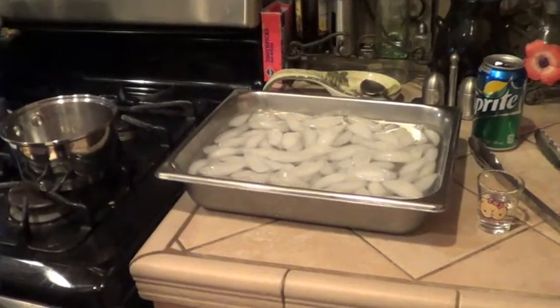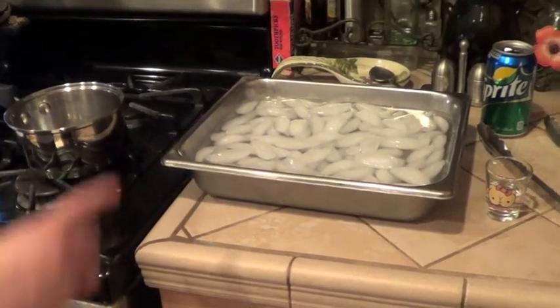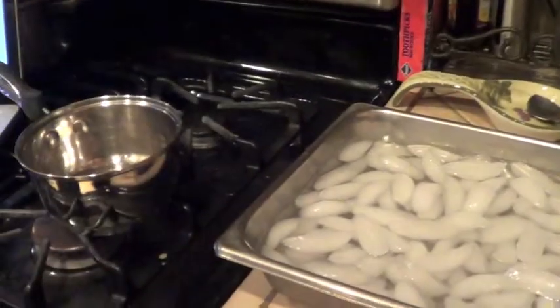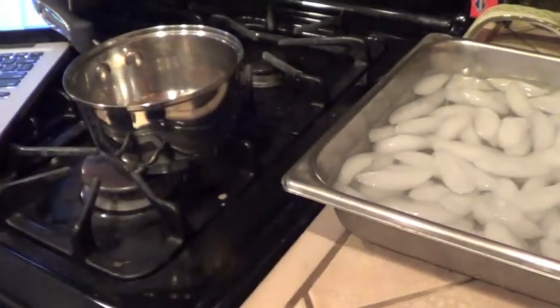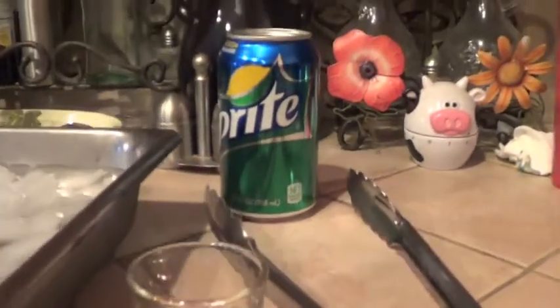The materials that will be used in this experiment today will be the aluminum can, a pot, tongs, an ice bath, which is here, fire, and we will also put about 15 milliliters of water inside the can.